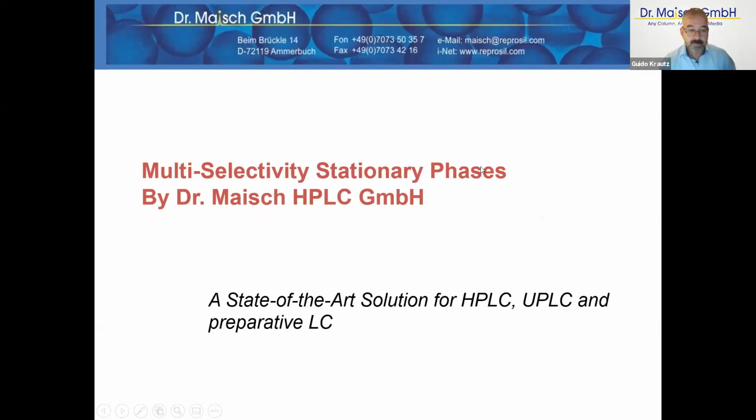Okay, as Guido has already mentioned, today I want to speak about multi-selectivity stationary phases, which is one of the most modern approaches to develop methods in HPLC.